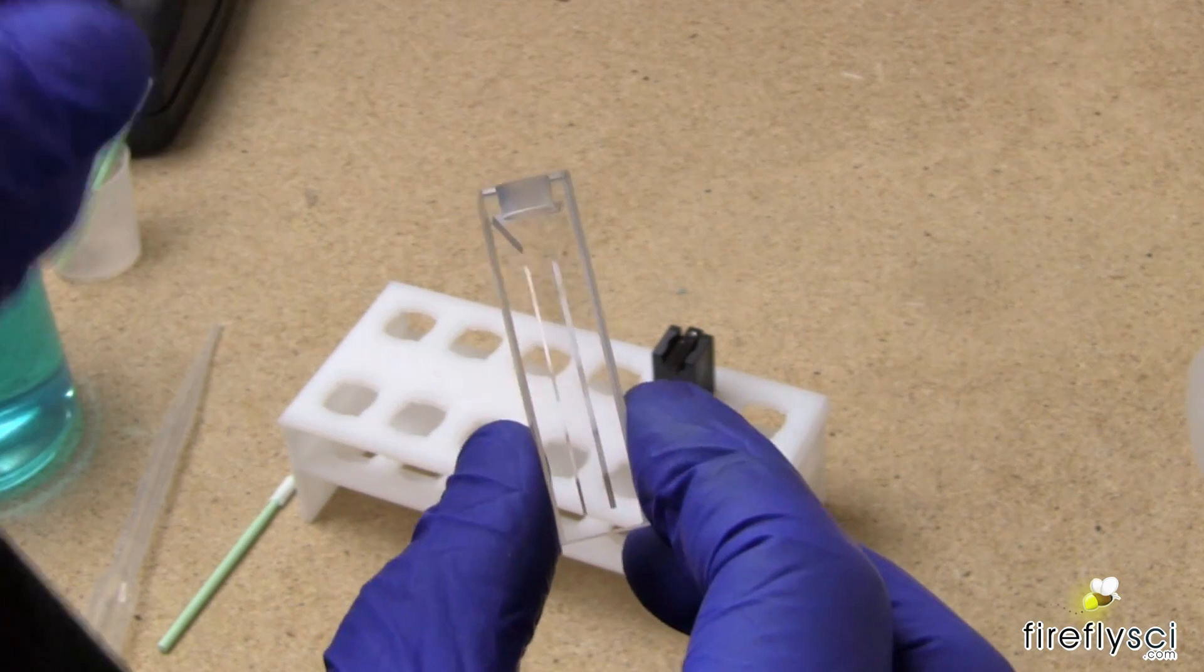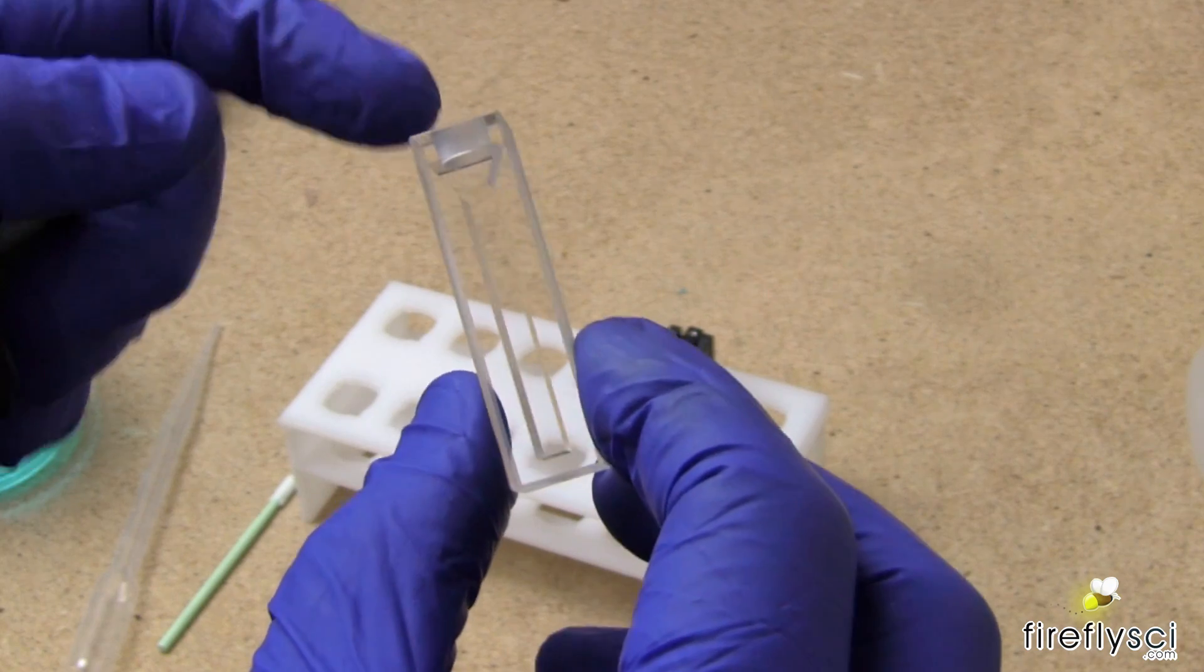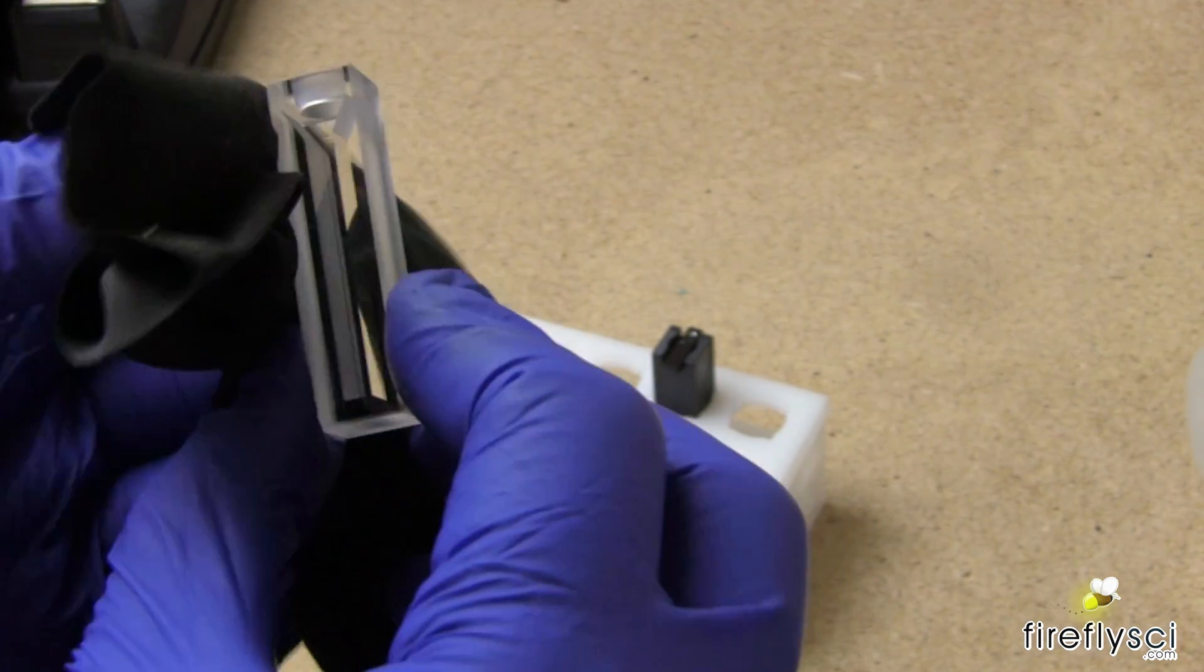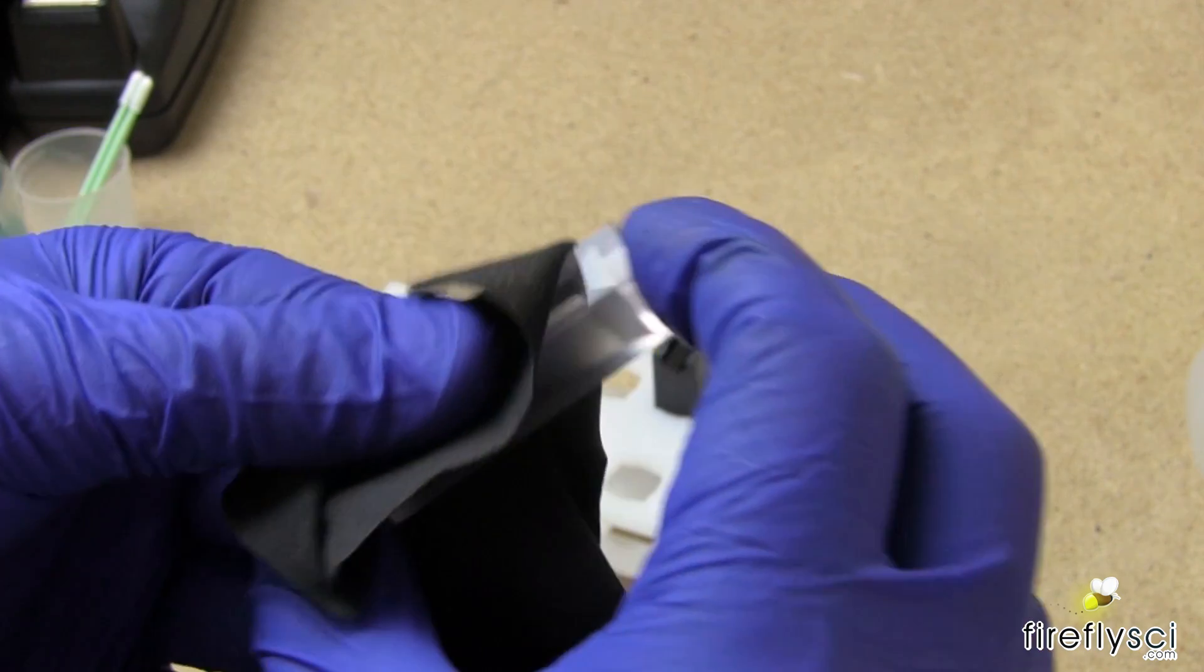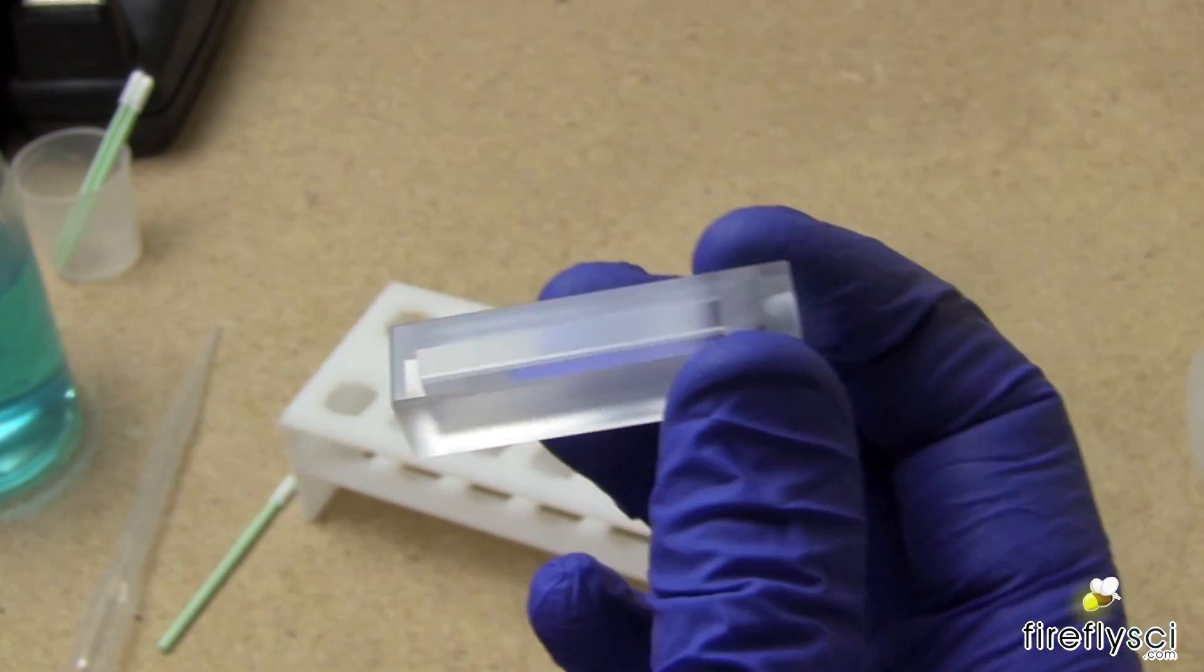Once you check the inside, you should also check the outside to make sure that there's nothing on the outside. Most likely fingerprints, and I'll just take a lens cloth here and just gently rub the windows here. And this looks pretty good. This looks like we're ready to go.